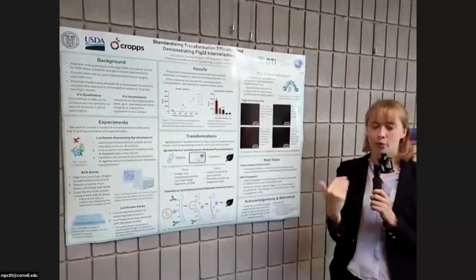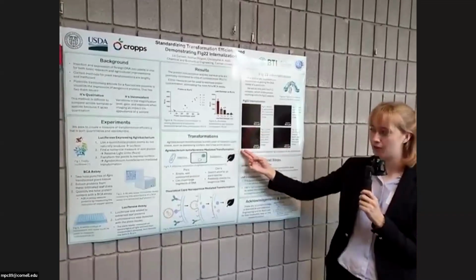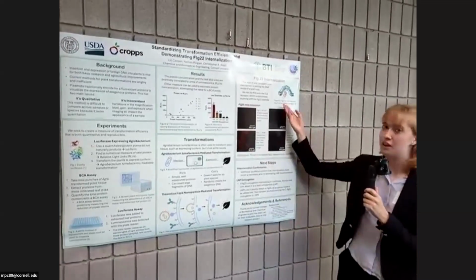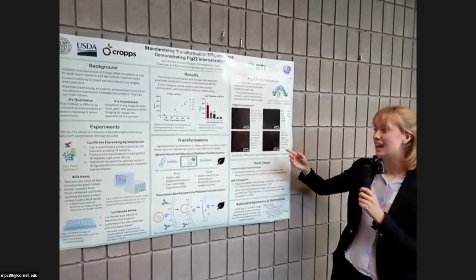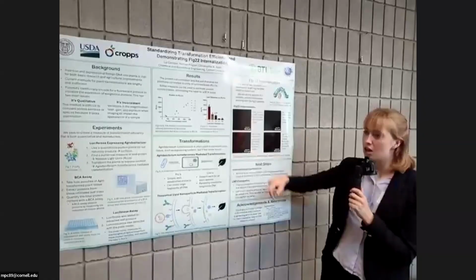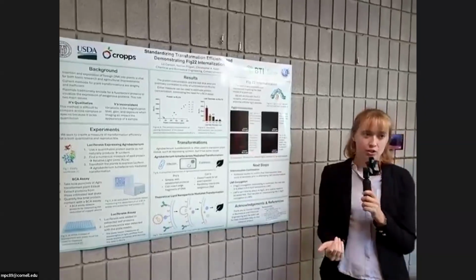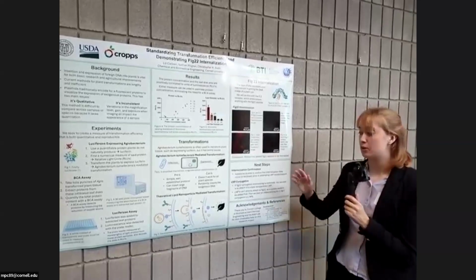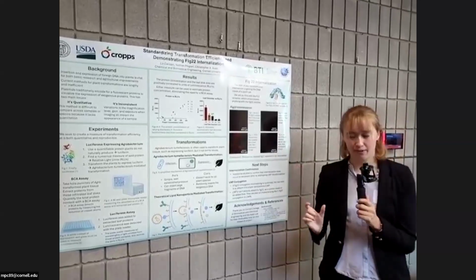When it is just the dye, no FLG22, it is just this basic background with no specific pinpricks of light. When we add just water, there's no fluorescence, which would make sense. And when we tried it in a different species, we got the same result of said pinpricks of light. Although this suggests internalization of the FLG22 and rhodamine, it does not confirm it. So we need to do further studies in that regard.